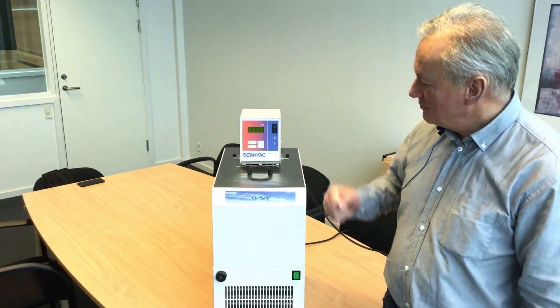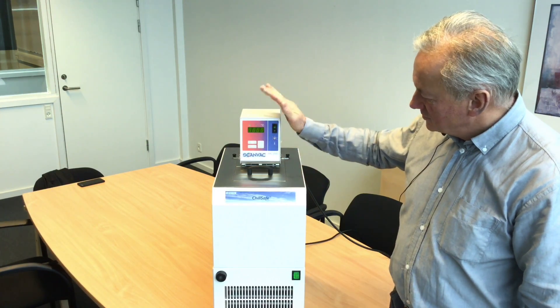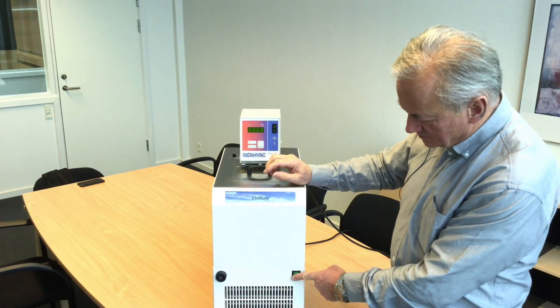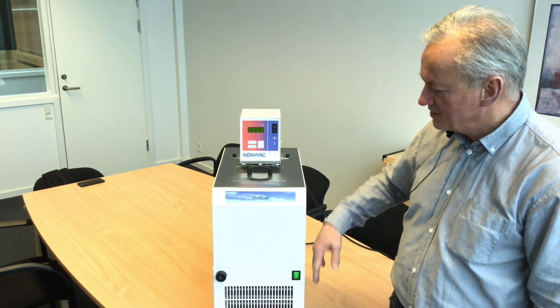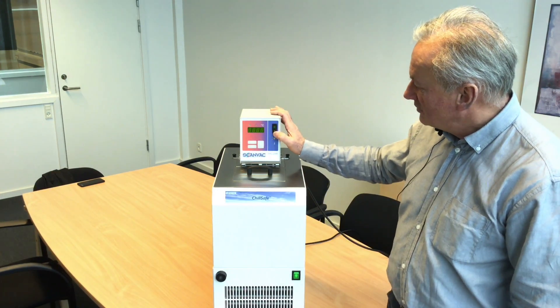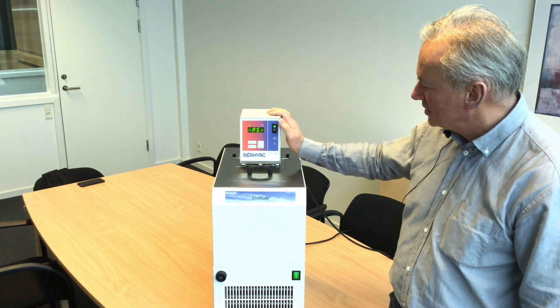We have now assembled the unit — the ChillSafe together with the thermostat on the bridge. Put in the liquid into the bath and turn on the cooling bath itself. The cooling system starts and brings the temperature down to minus 30 degrees Celsius. But now you are able to control the temperature in the liquid by use of the thermostat.